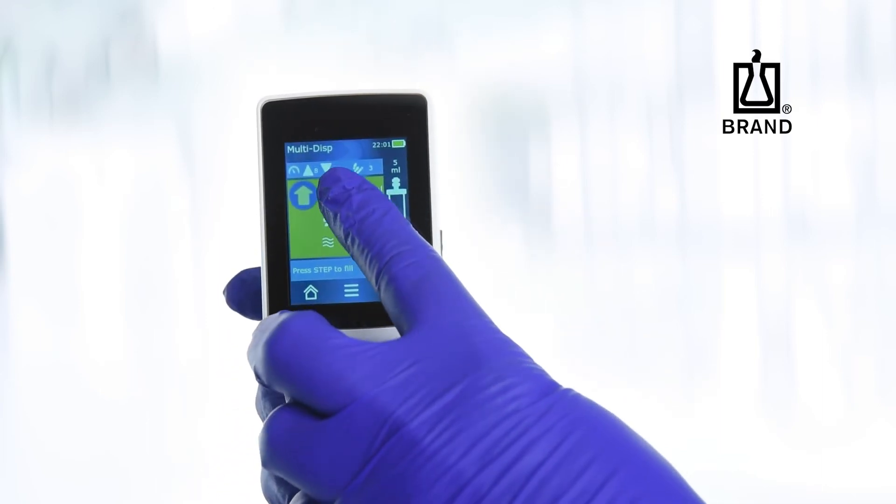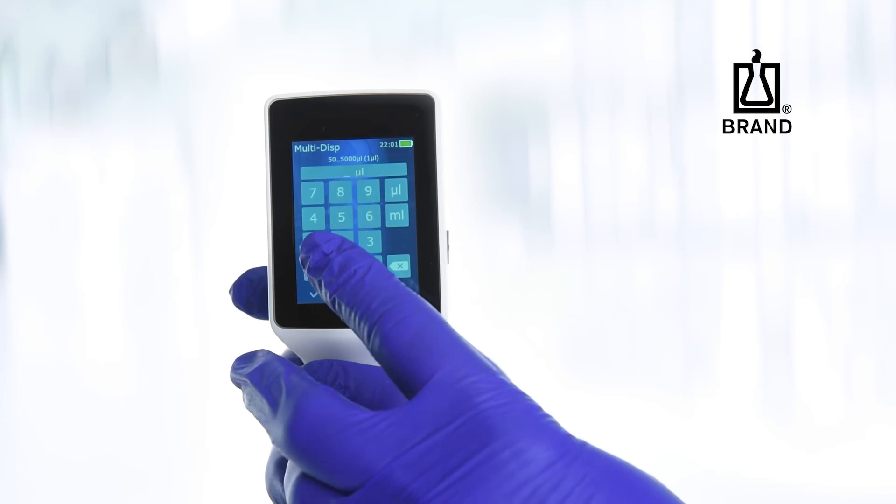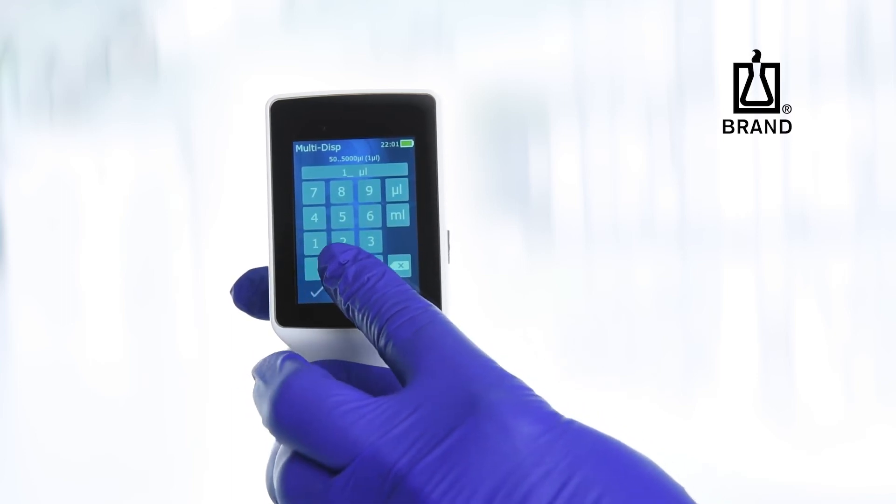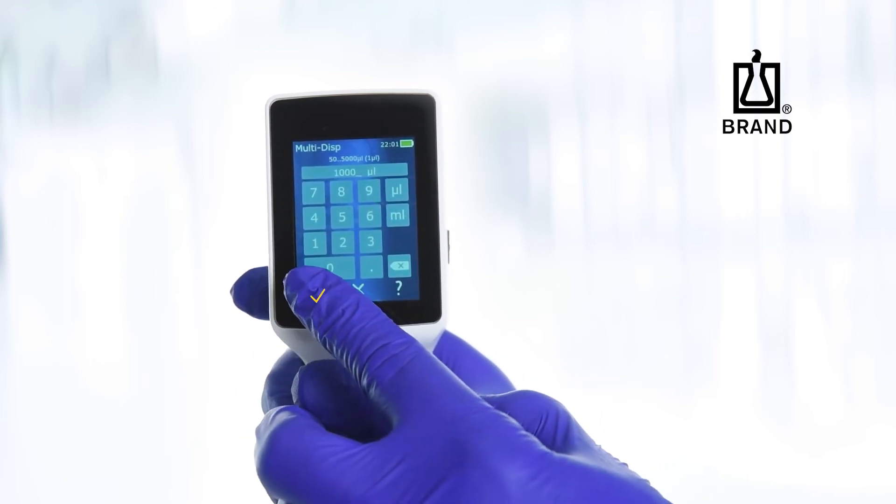To set the desired dispensing volume, tap on the water droplet icon. Type in the desired dispensing volume using the keypad, then tap to confirm.